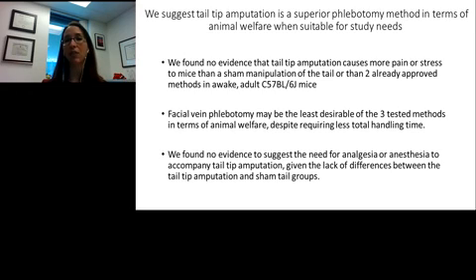And if you're going to give that drug long enough to kick in, you would have to do that well in advance of your blood collection procedure for those drugs to really be on board. Unfortunately, that handling impact and the stress it causes the animal may impact your data collection, what you're measuring in your blood sample. And truly, the benefit provided by that analgesia may not outweigh the additional stress caused by that additional handling and administration procedure.